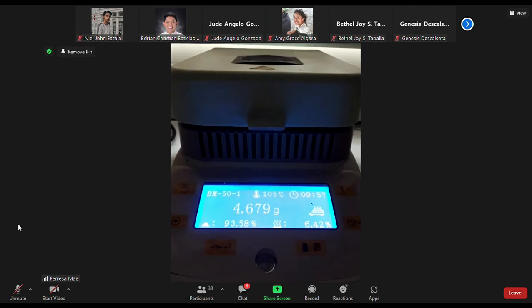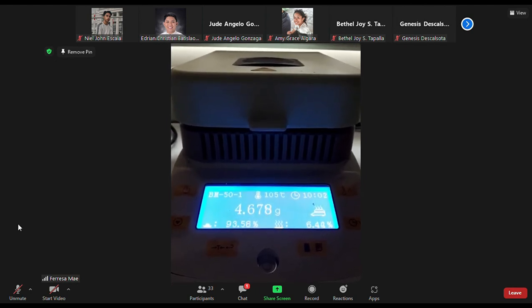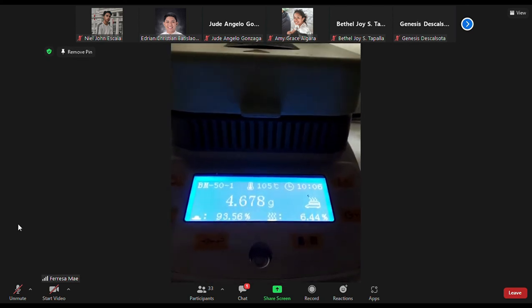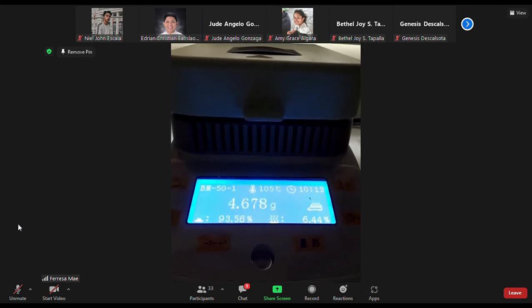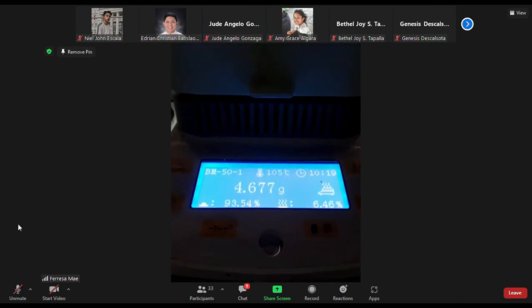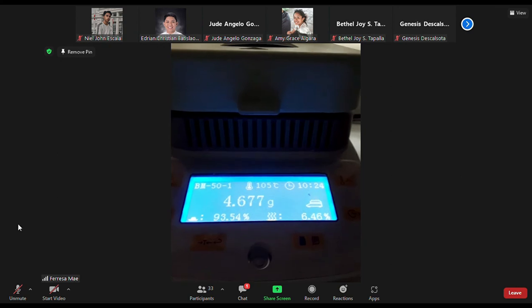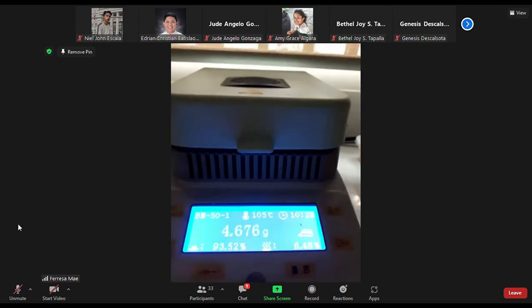Speaking, try ko pala Miss ang sa budget bar pala Miss. Ang last yang weight is 4.152 tapos ang iyang initial weight is 5 grams. Tapos hintay ko Miss suma Miss ang moisture na nakuha ko hindi equal sa moisture na nakuha sa instrument. Pila yan ako? Kung insuma mo? 16.96 Miss. Pero lain siya kaysa ang sa conventional method is oven drying to constant weight.